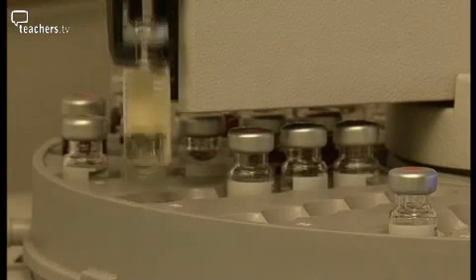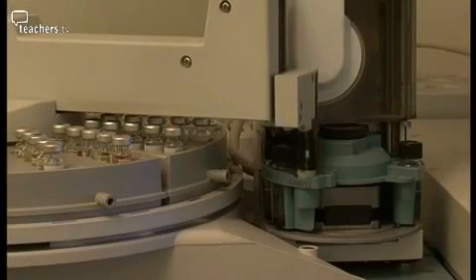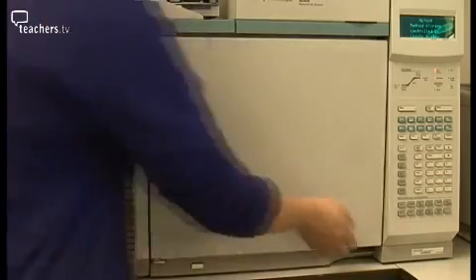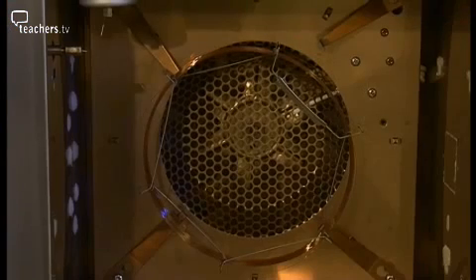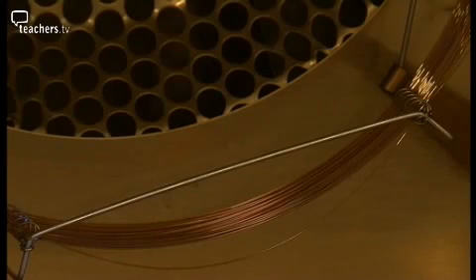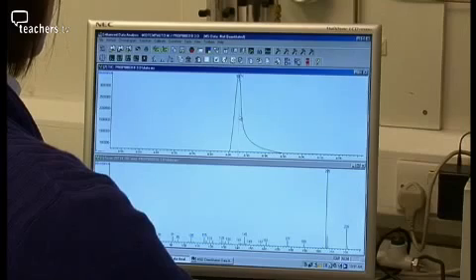When you place your sample in the autosampler, it injects your sample into the gas chromatograph. The injection process is automated to ensure uniformity. The injected liquid is vaporized in an oven and converted to a gas. The gas is then transported through a very fine tubular coil called a column. The journey through this fine tube becomes a molecular race in which an element's boiling point is key. Depending on what's present in the sample, its boiling points will be quite critical. Different boiling points affect travel time through the coil.